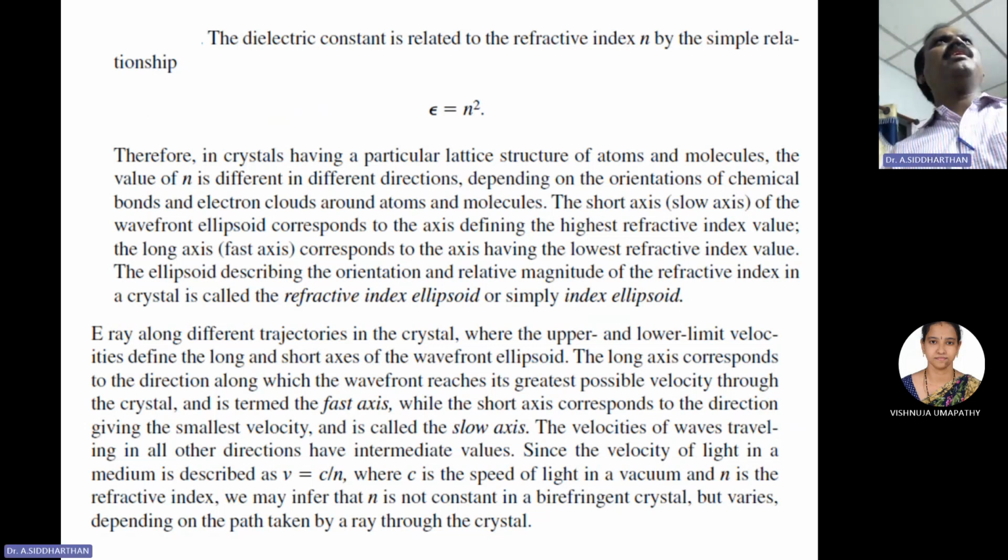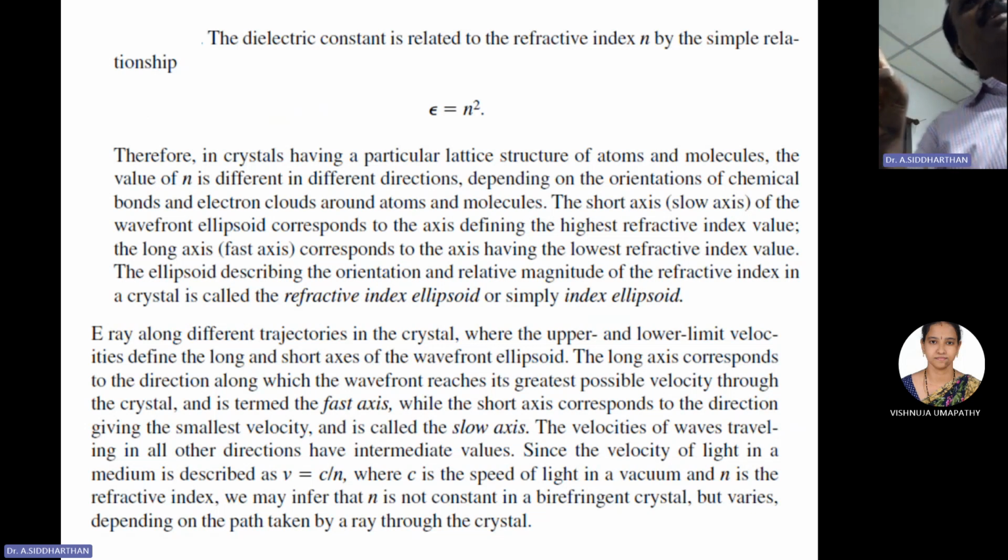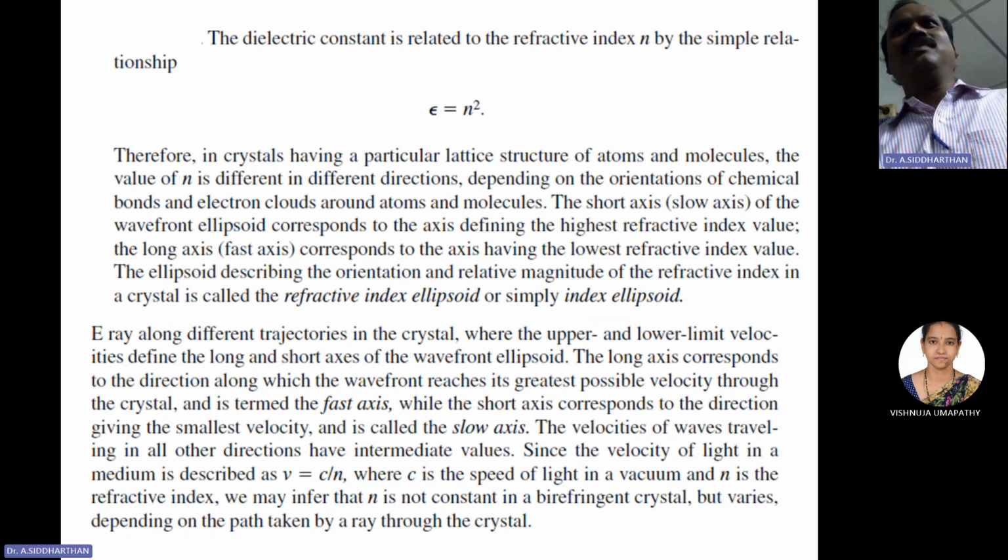The eye is not able to discriminate the phase, or the plane of polarization. If I am looking at this tube light, it is giving vibrations in all directions. If you are sitting aligned towards the tube light, it does not mean that only one type of polarized light enters my eye. So the eye does not have the capability to identify phase differences or polarization changes.